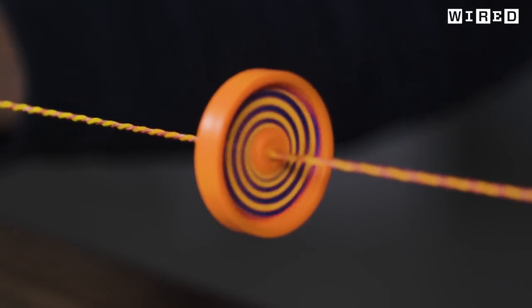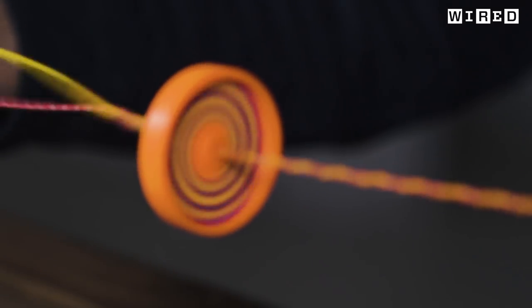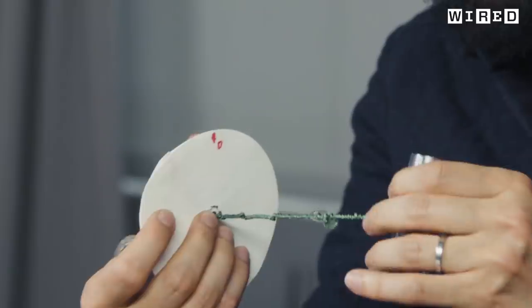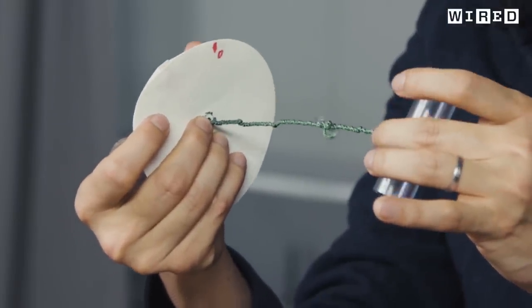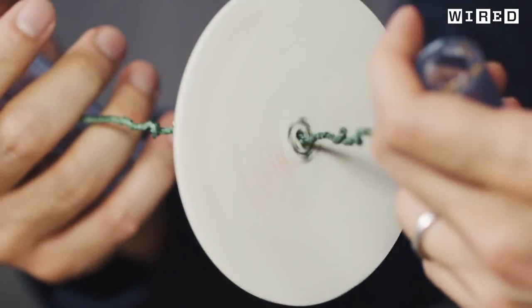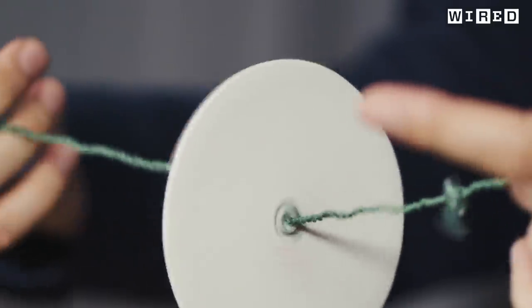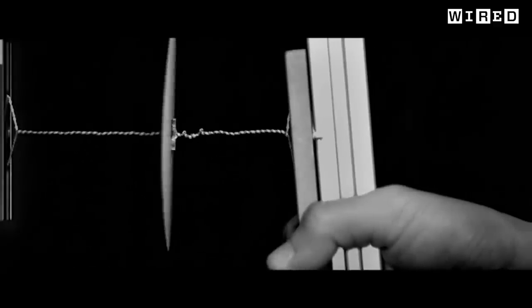The paperfuge is based on a classic toy called a whirligig, a design that's been around for thousands of years, but it wasn't until recently that anyone developed a physical model for how it works. Conventionally, a string has a geometrical limit to how much it can coil; beyond that limit, twists cause it to pop into the third dimension, forming a coil of coils — a phenomenon called supercoiling. Supercoiling turbocharges the paperfuge up to 125,000 rotations per minute, generating 30,000 G's — enough to isolate malaria parasites in minutes.